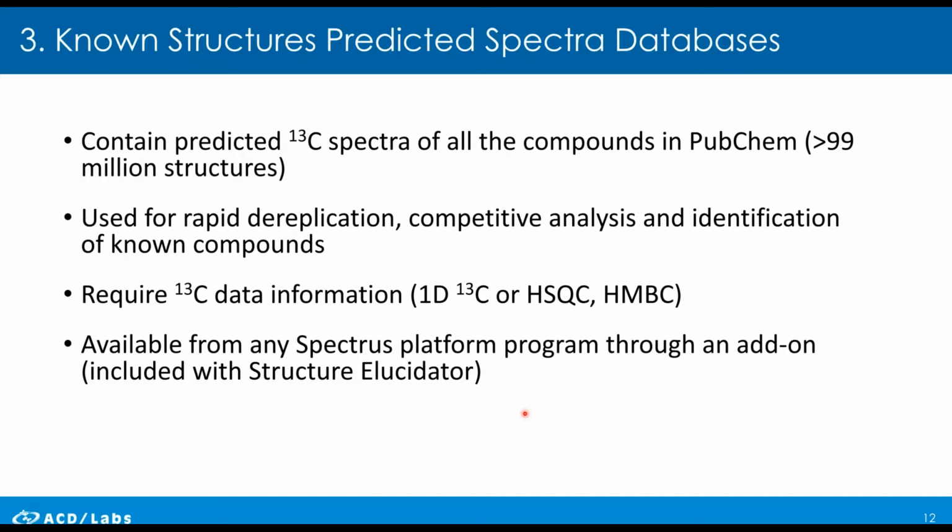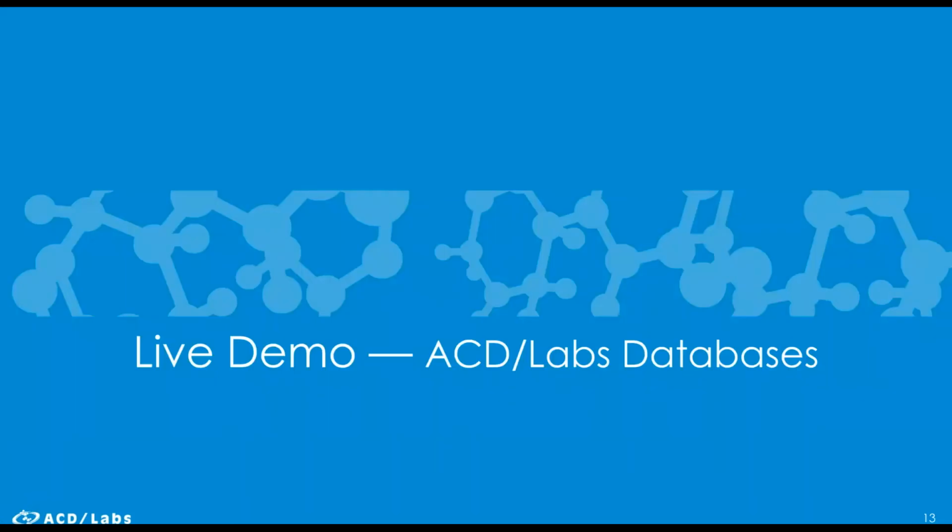These databases are again available from any Spectrus platform program. However, you need an add-on, which we refer to as the known structures add-on. And this will allow you to use these databases. This option is included by default with Structure Elucidator. So I'm going to stop with the PowerPoint now and jump into the software.